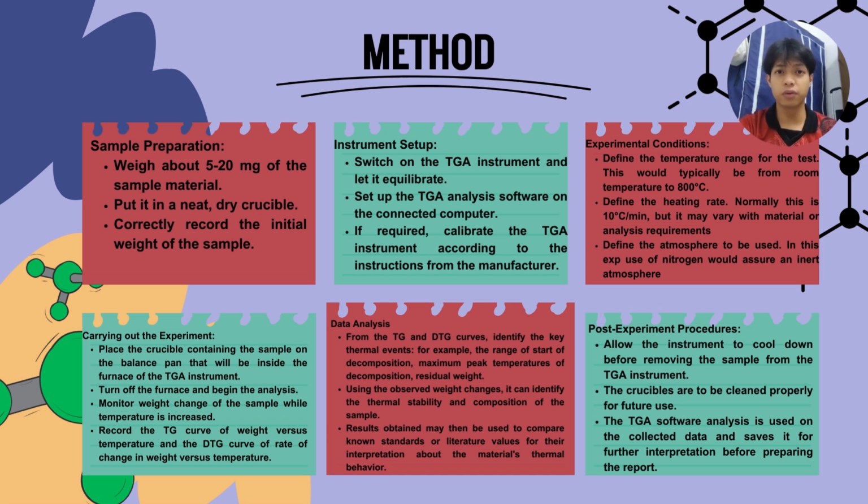Next, we move on to the instrument setup. We switch on the TGA instrument and allow it to equilibrate. The TGA analysis software is set up on the connected computer. If needed, we calibrate the TGA instrument according to the manufacturer's instructions to ensure accurate results.